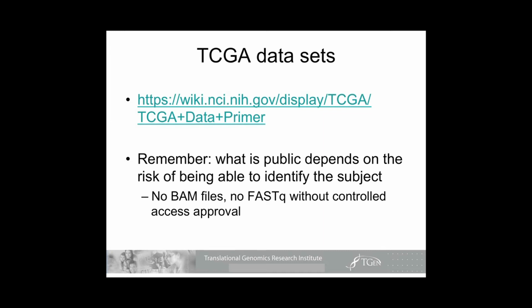So the TCGA data sets. This is the link to the data primer. This is your new best friend, because you won't remember this 2 days from now, and it is a great place to start going and looking through when you think, well, I've got this file and I can't remember what this header was.